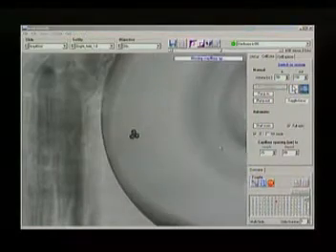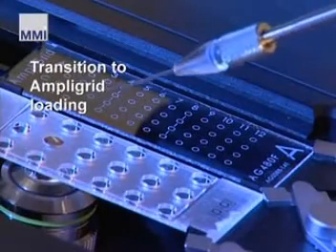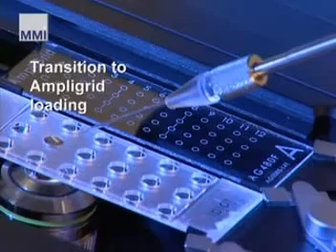For an ampigrid reaction setup, precise aspiration and deposition with the selector is within the range of nano volumes.